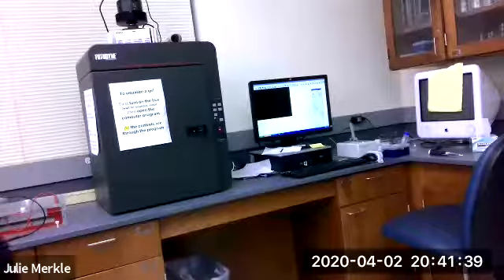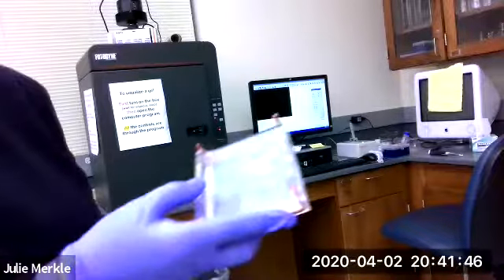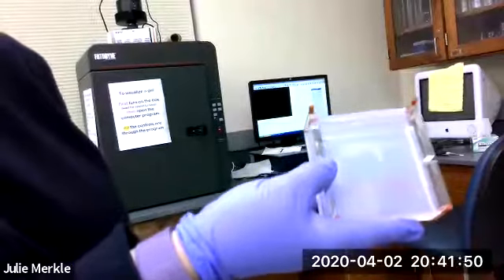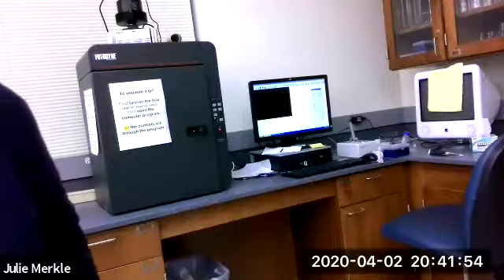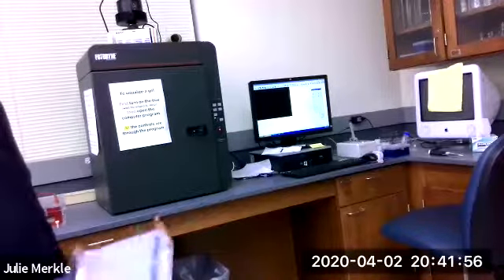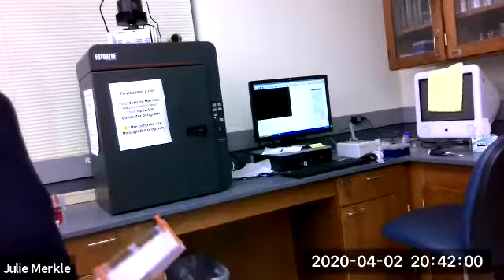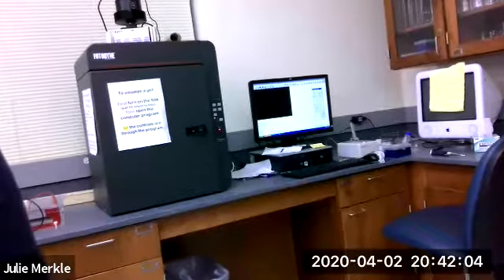So this machine over here is a transilluminator. It has a UV light inside that can be used to visualize the gel. Our gel, which I'm holding in a gloved hand because of the ethidium bromide, you can see that purple dye down there. It has gone about 3/4 of the length down the gel, that dye, and so our sample should have also gone that far. And so I'm going to put this in the transilluminator and take a picture of it.